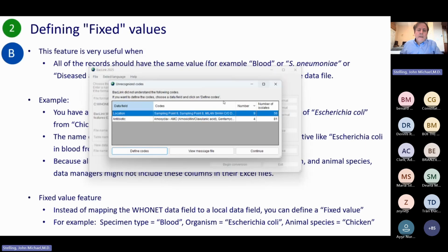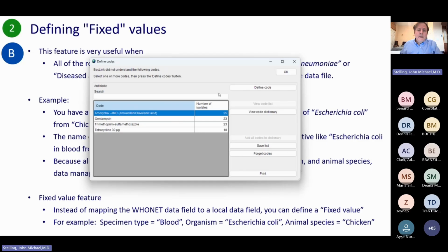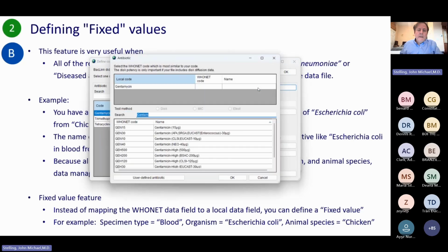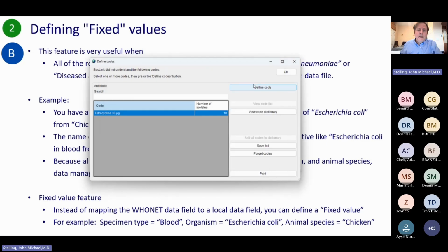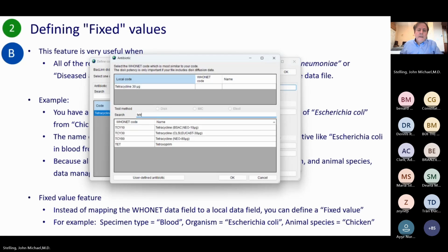OK. I'm not going to do, well, I will do maybe 2 or 3 antibiotics. This is a small sample data file. It's not real data. Amoxiclav. That's amoxiclav, and I choose the correct disk potency. 20 micrograms and 10 micrograms, okay. Gentamicin, CLSI is a 10 microgram disc. Trimethoprim sulfa, CLSI is that. And tetracycline. It's having trouble understanding this, so I just type tetracycline, good, CLSI, okay.